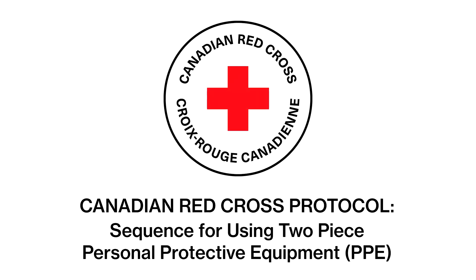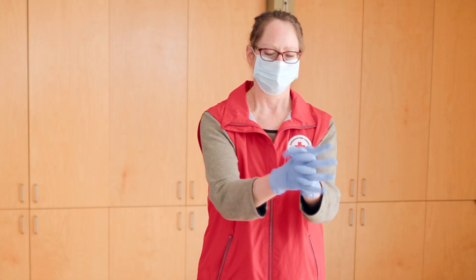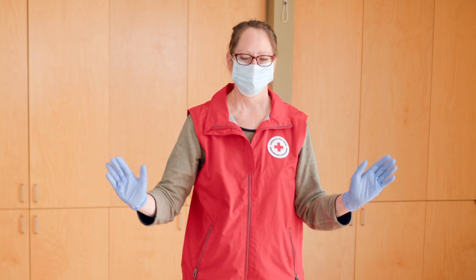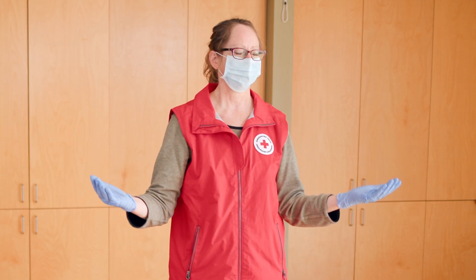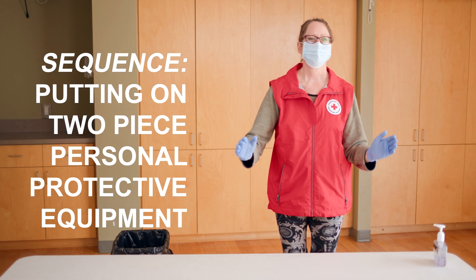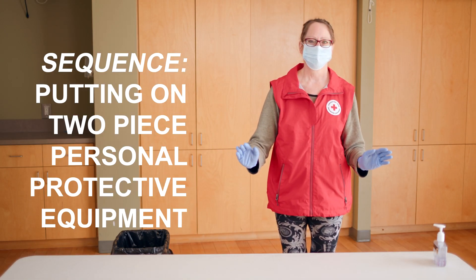The Canadian Red Cross Protocol for the correct sequence for using personal protective equipment. To guard against contamination, it's very important you put on and take off your personal protective equipment safely and in the right sequence. See our other videos for details on how to use each piece safely.